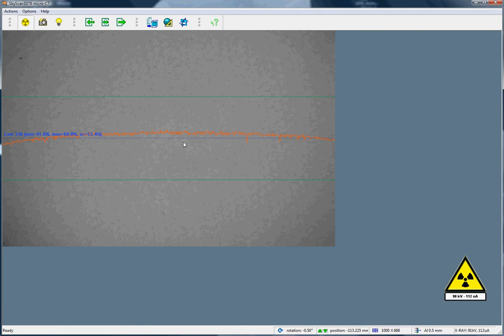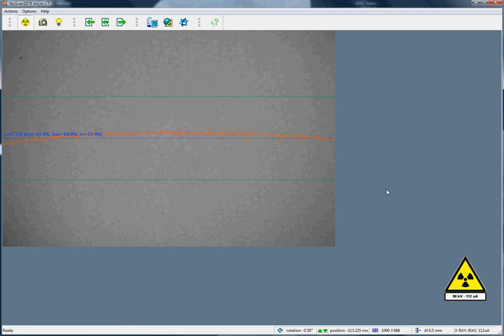So, how do we adjust the mode? The current mode we are looking at can be seen in the bottom here. It corresponds to the 0.5 mm aluminium filter, and the applied voltage is 90 kV. You might see this with the standard high voltage configuration set. Let's say we want to change the applied voltage from 90 kV to 70 kV.